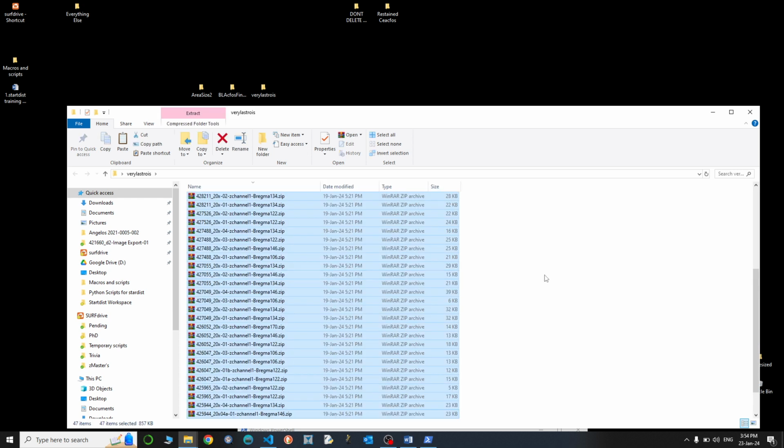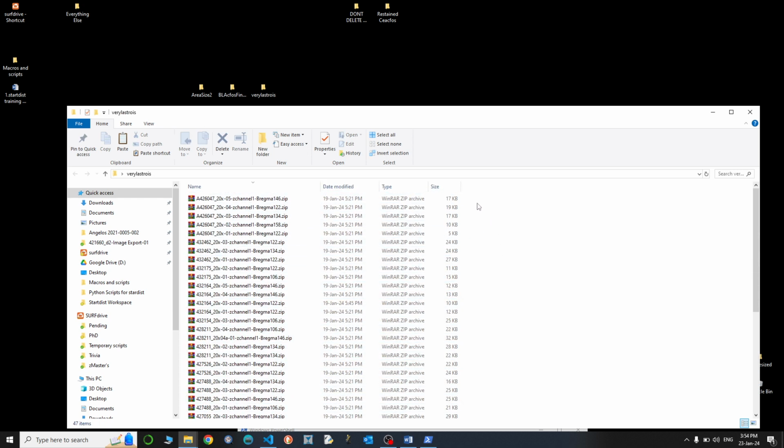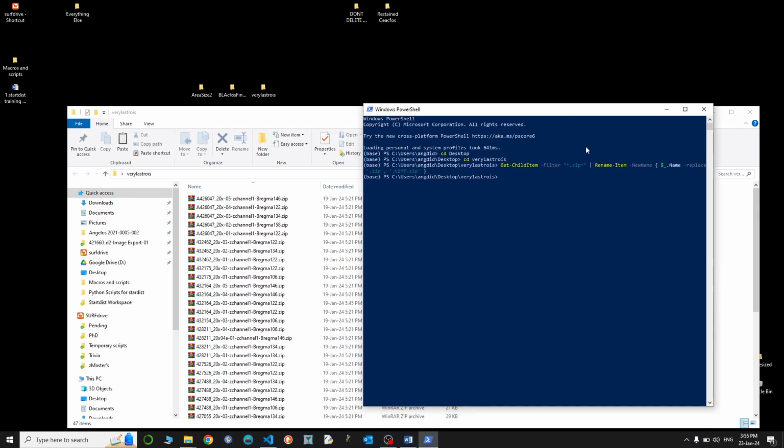I'm pasting it here. I will just tell you in advance that again I have to rename these files because I want to include the TIFF. This is also in the instructions. It's telling you how it should look. So if it doesn't look like you want it to be, it depends on some steps in the pipeline that you've taken in the past.